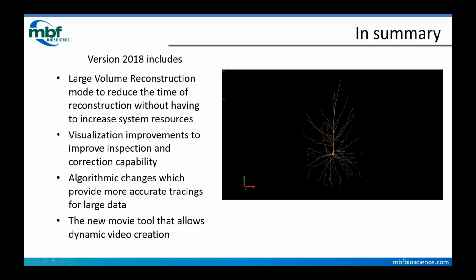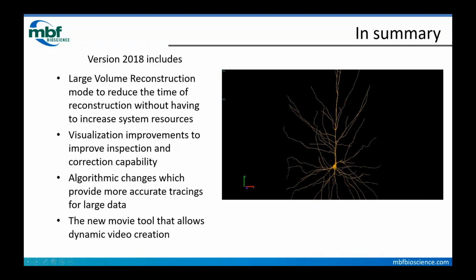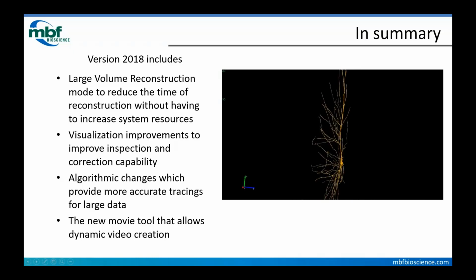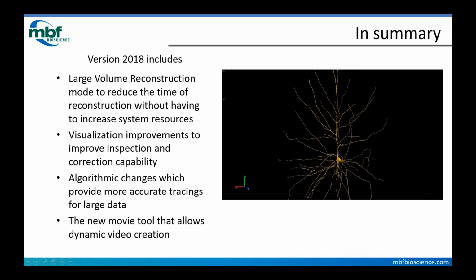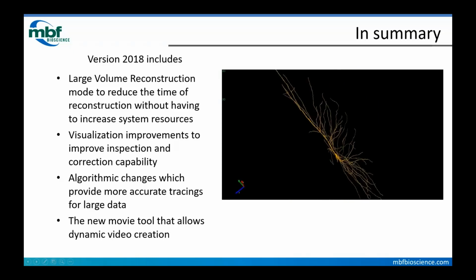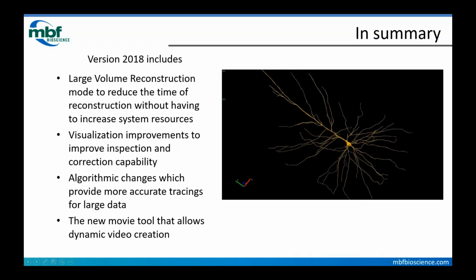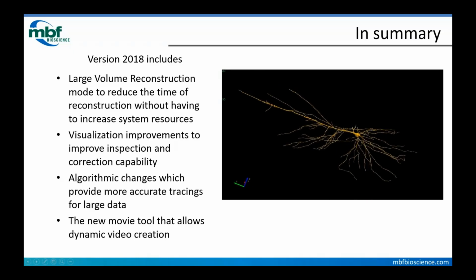Who doesn't want the latest and greatest? Yeah. But this large volume reconstruction mode is a way to make the most of what you have right now, and it will only improve as you continue to upgrade your machine, either with solid state hard drives or with a PCI chassis or anything like that. Those are things that can only make this process better.